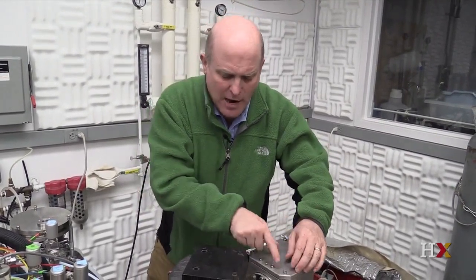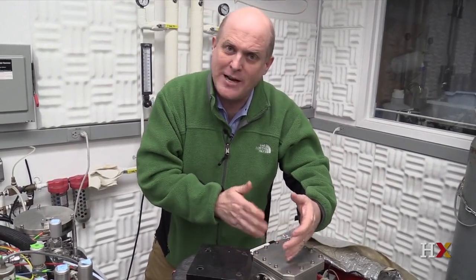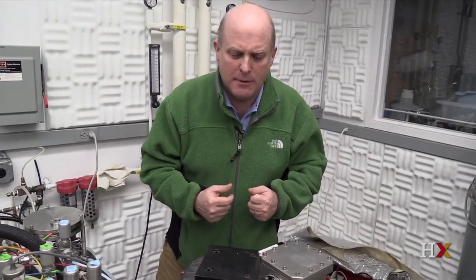And so by counting these 3 different ion beams, we can actually measure the ratio of carbon-13 to 12 and oxygen-18 to 16 in the sample.